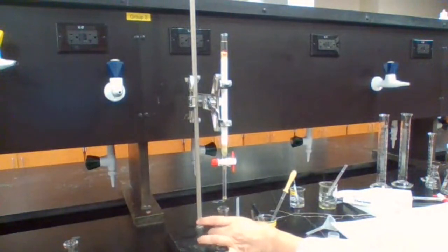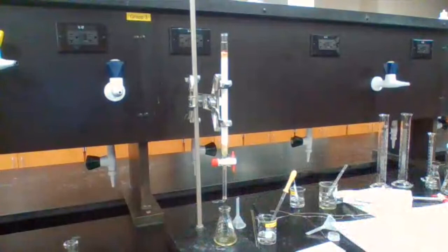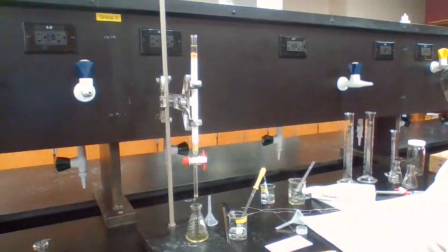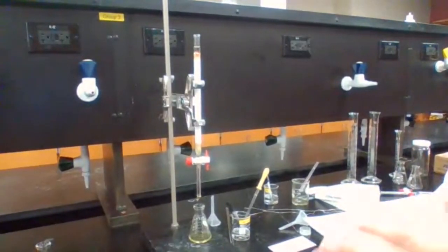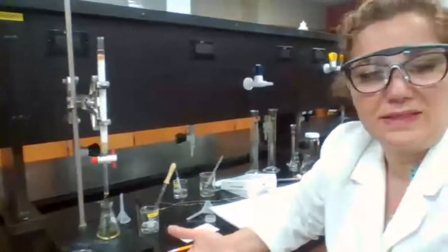So chromatography as a separation technique is very strong. For identification technique, it's good, especially if you have like comparing known to unknown. So if you have your set of known samples, then it is great.